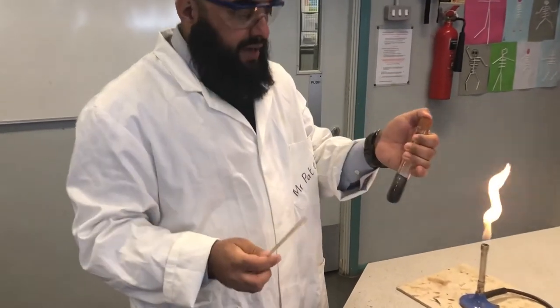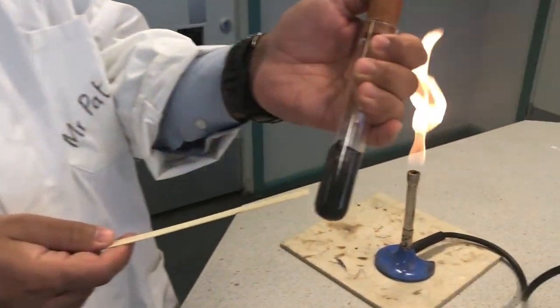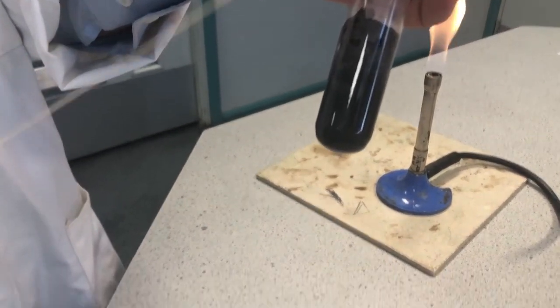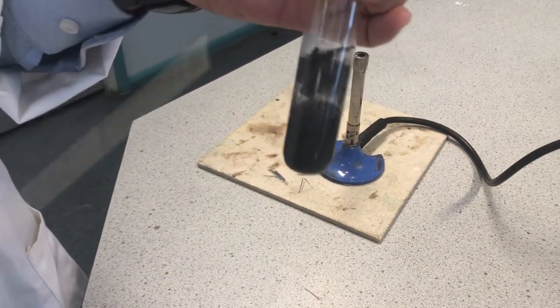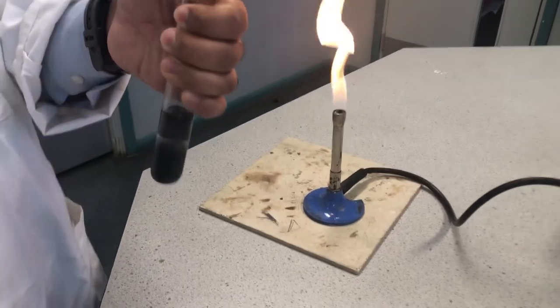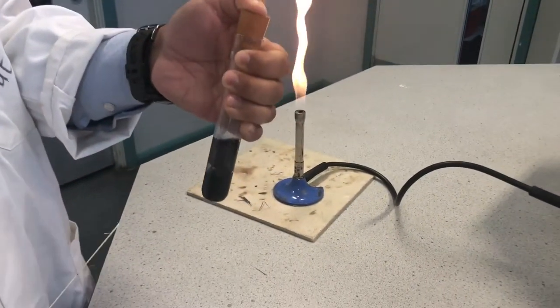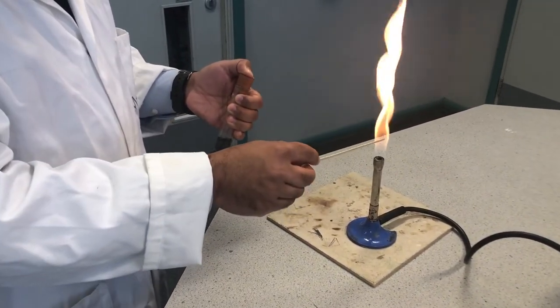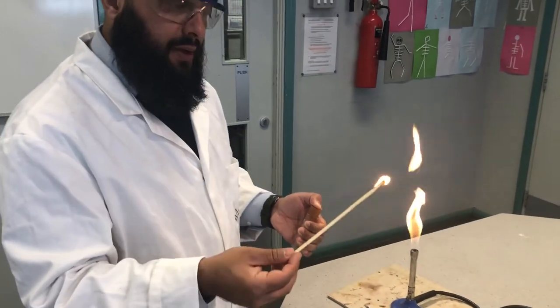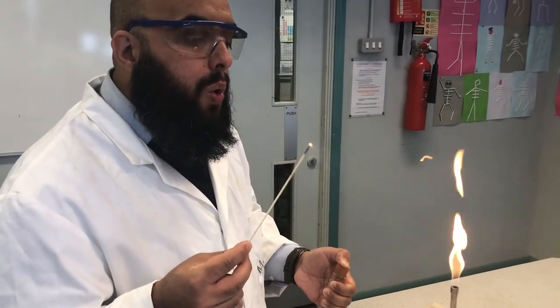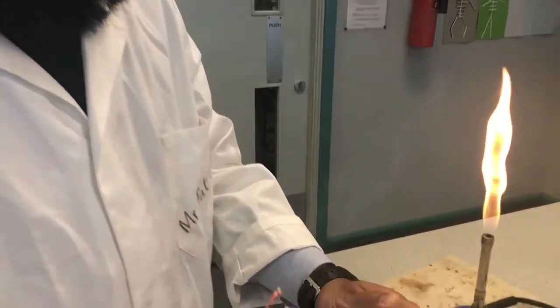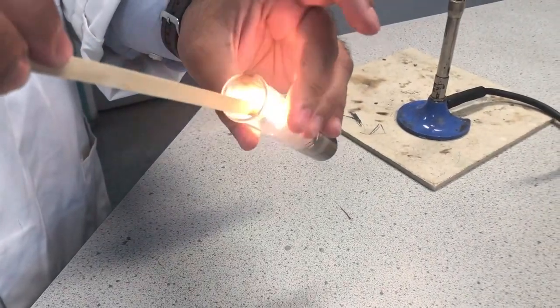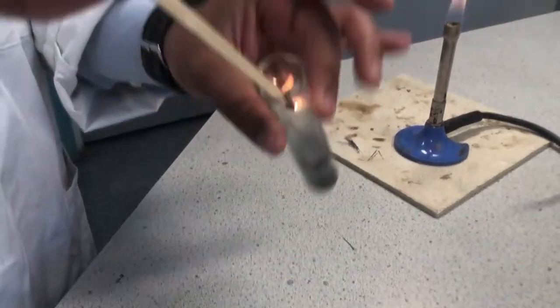Okay, what I've got over here is a different chemical reaction now. So in this test tube, we have some manganese dioxide powder. You can see it fizzing away as it's reacting with hydrogen peroxide. The fizzing is usually an indication that a gas is being produced. So in here now, we have our gas produced. I can feel, again, the pressure building up on the rubber bung as the gas is trying to escape. So this test is slightly different to the last one that we did, because, again, I'm lighting my splint. But this time, rather than using a lit splint, I'm going to put it out so now it's glowing, as you can see there. Just place it into the test tube, and as you can see there, it relights. It's glowing with quite a bright flame, just there.